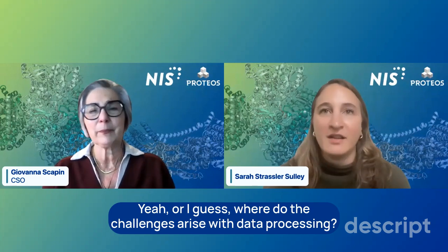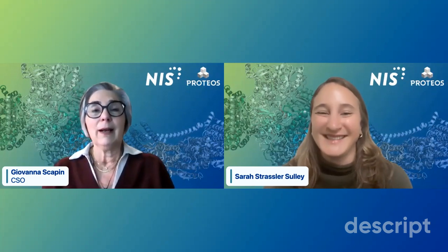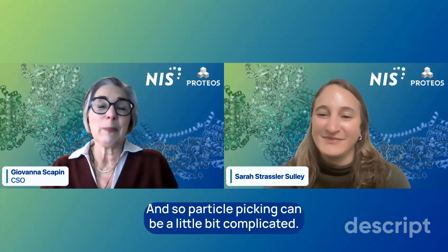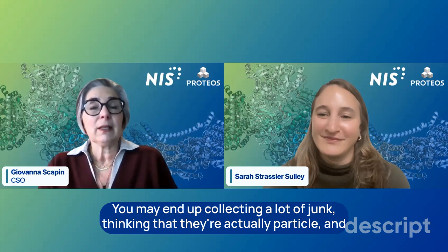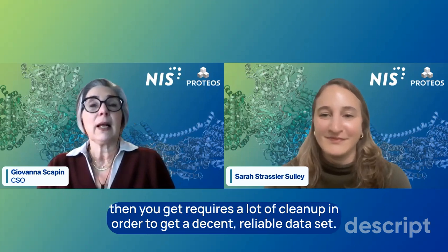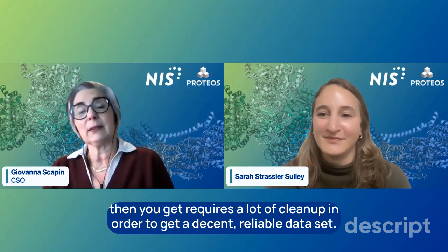Yeah, or I guess where do the challenges arise with data processing? Everywhere. Small particles are difficult to see to start with, and so particle picking can be a little bit complicated. You may end up collecting a lot of junk, thinking that they're actually particles, and that requires a lot of cleanup in order to get a decent, reliable data set.